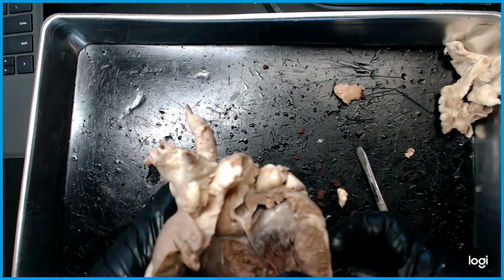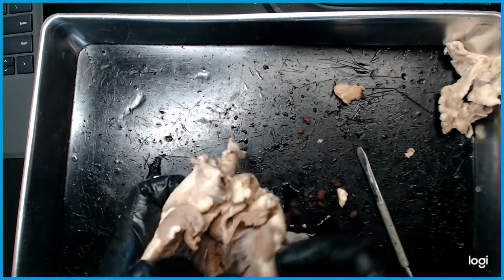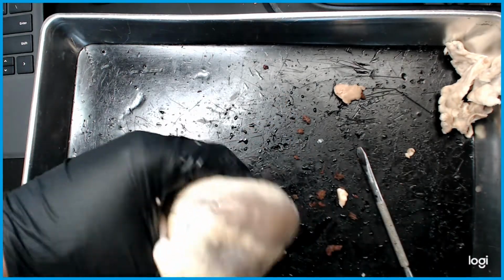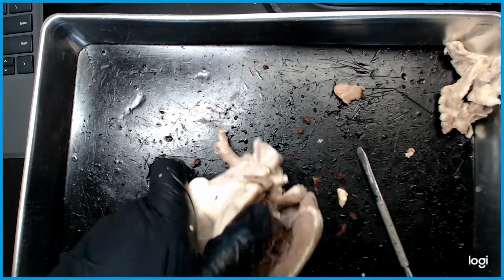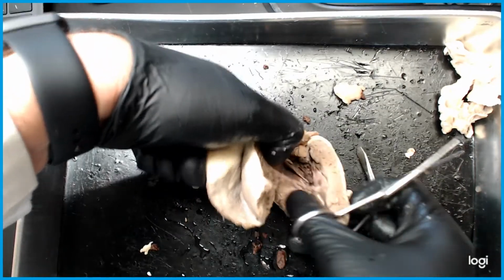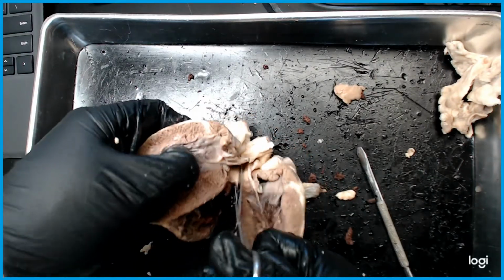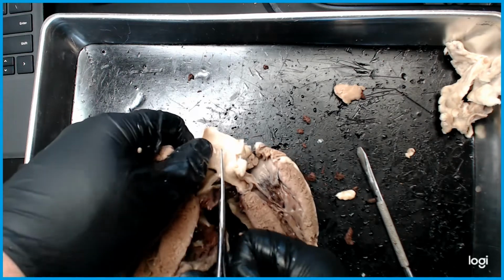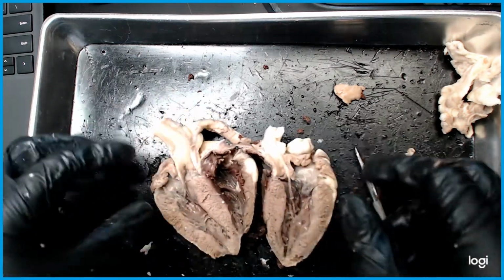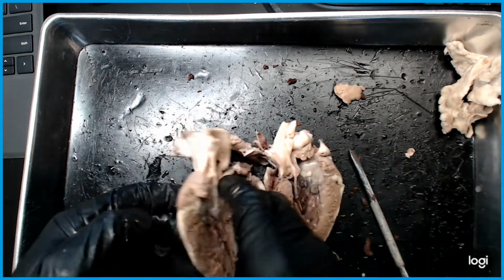If we look at the septum, now that we have done this cut, we can actually separate down the septum to continue having an anterior and a posterior portion of this. So let's go and do it. So let's continue our coronal cut then. And you now have your heart in two halves, anterior and posterior.